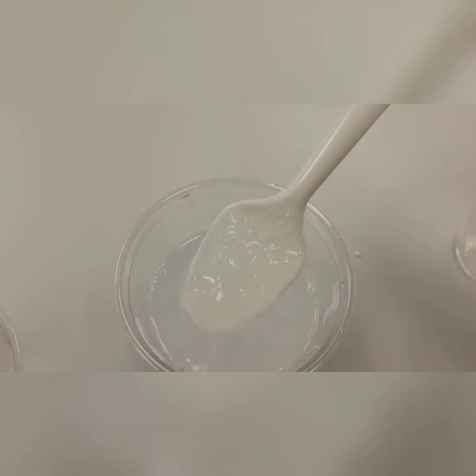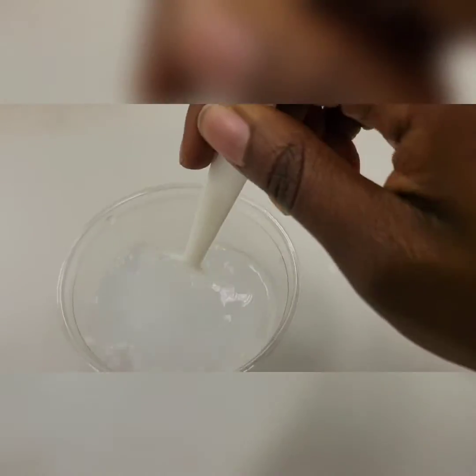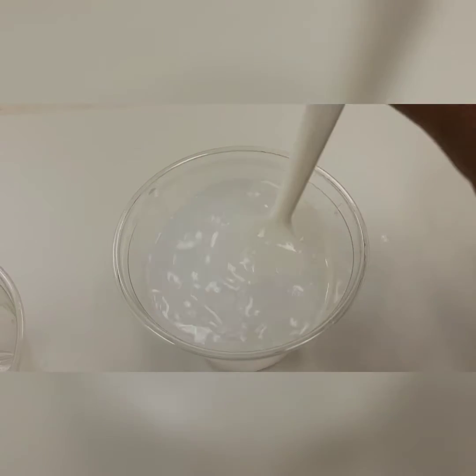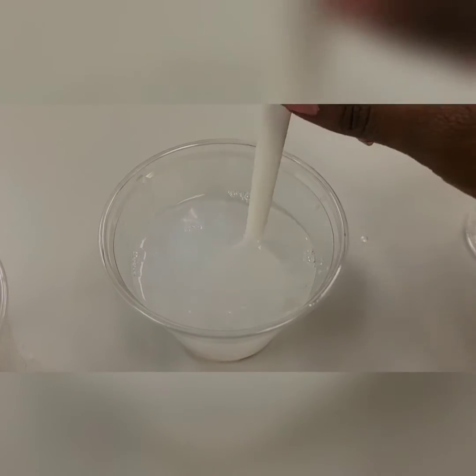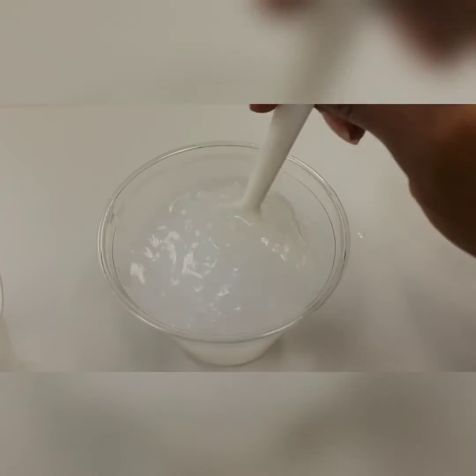So I do see more solid jelly-like pieces in there. And I am going to be stirring, and I will let you guys see everything that is happening.